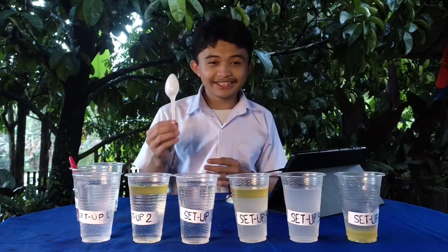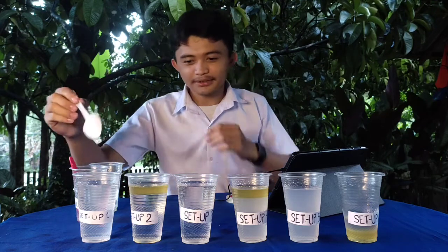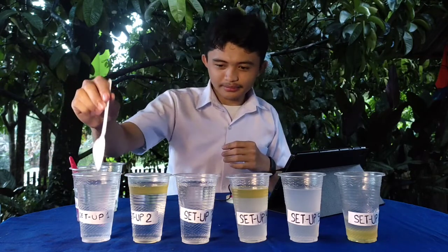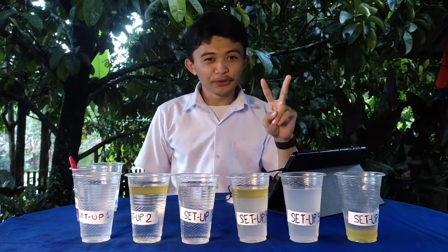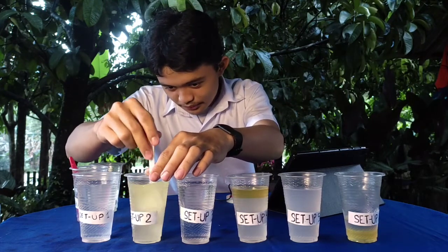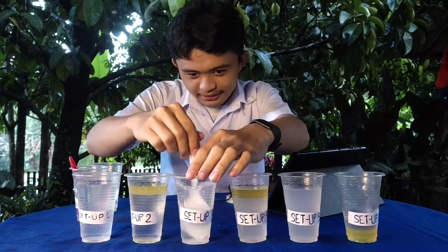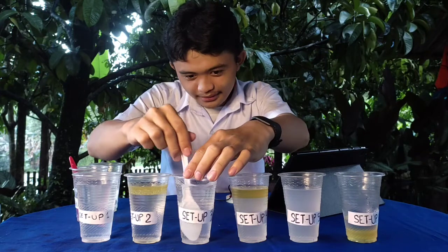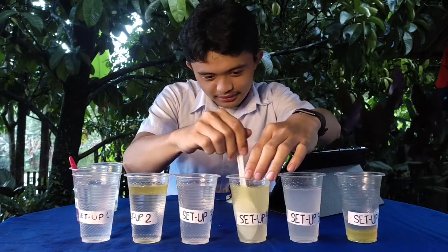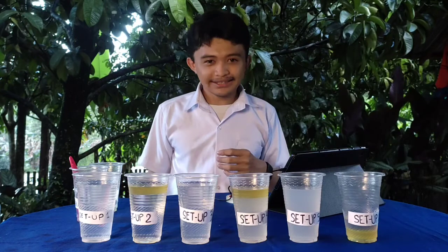So using our spoon, let's stir each setup — one, two, three, four, five, and six. Let's begin with setup one, then setup two, setup three, setup four, setup five, and lastly our setup number six.